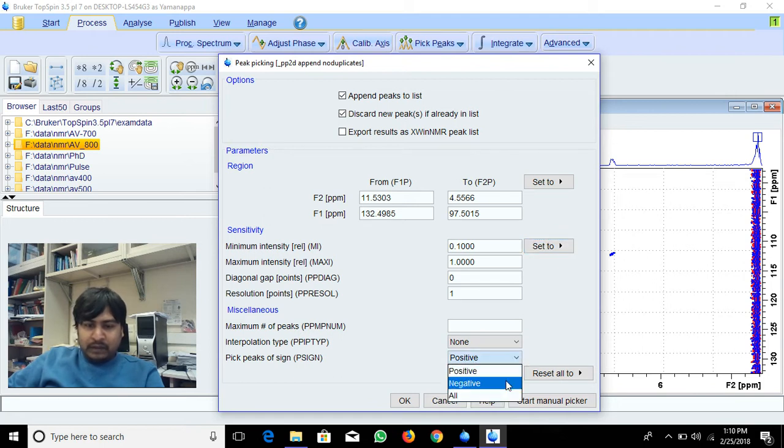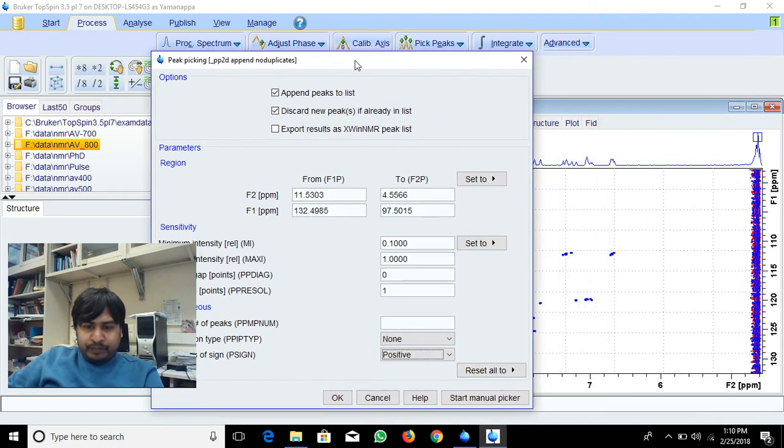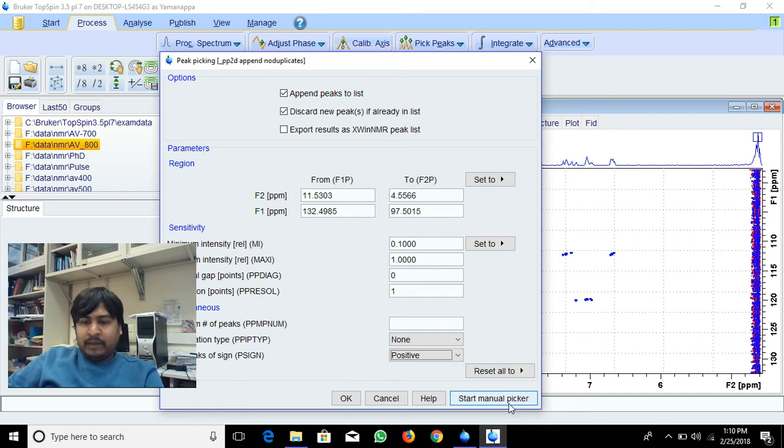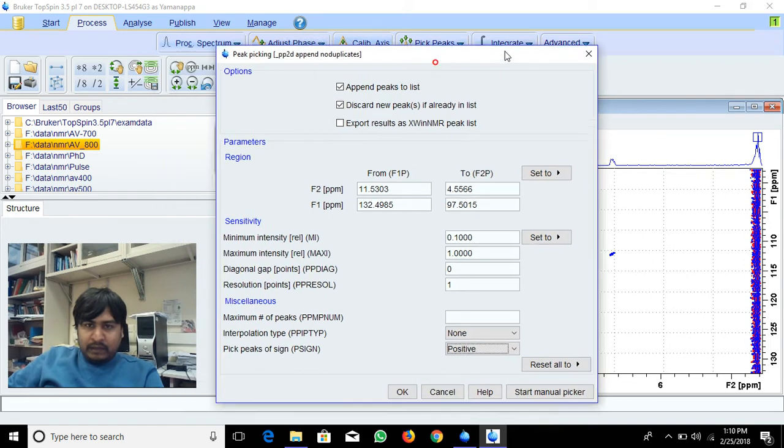When you click here it will execute. Also, if you start manual picker, it will pick manually. You can try that and see what happens next. Okay, so it started.